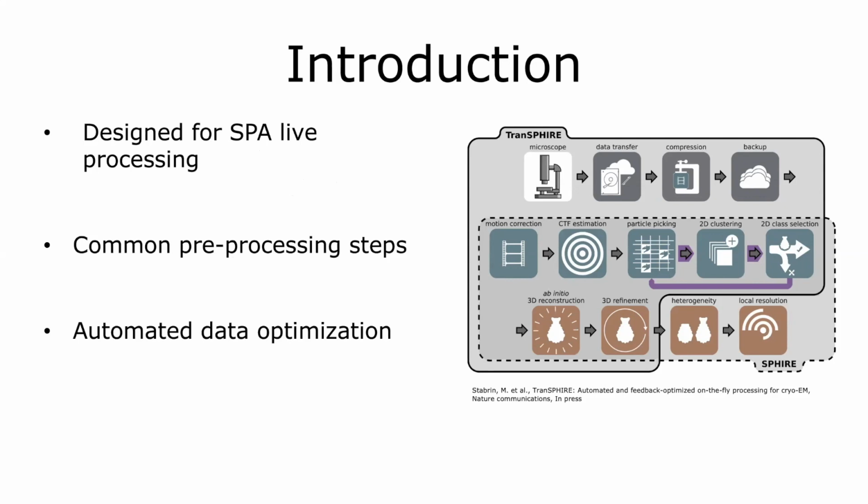That means we can now collect thousands of images within a few days, while previously it was only a few hundred. So we create tons of data, but at the same time, this data does not necessarily mean to be the best data possible, especially because automation is usually a trade-off with quality.